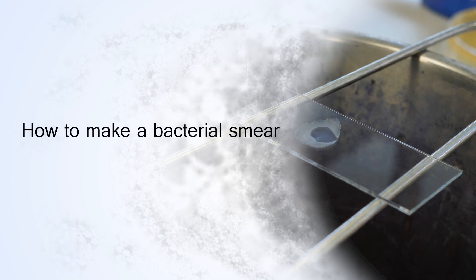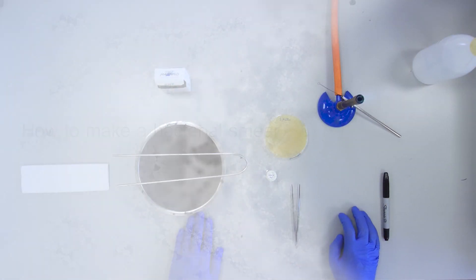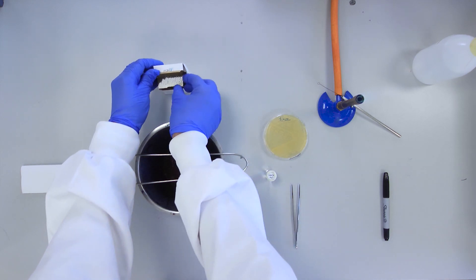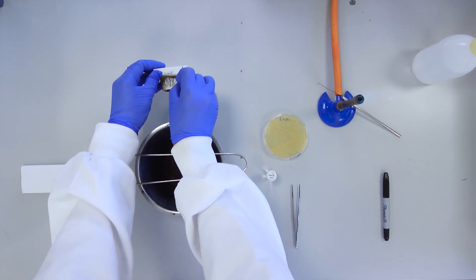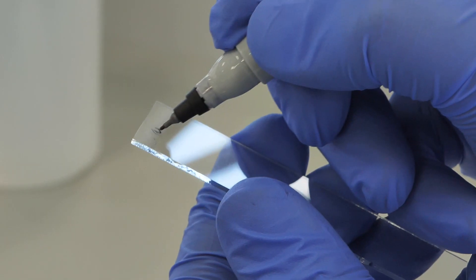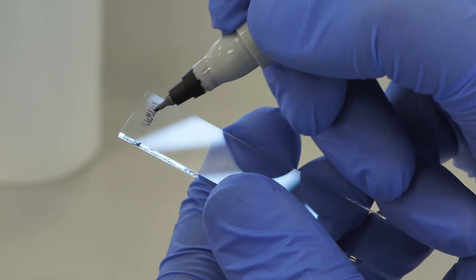How to make a smear and carry out a simple stain. Before staining, it is necessary to prepare a bacterial smear. Label a glass slide at one end with the culture name.